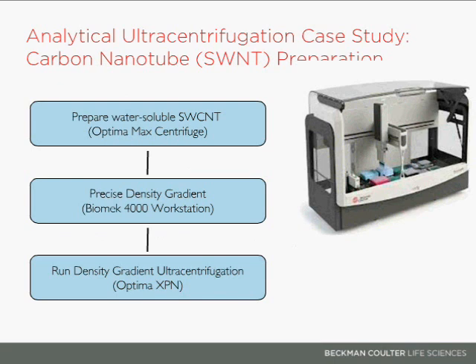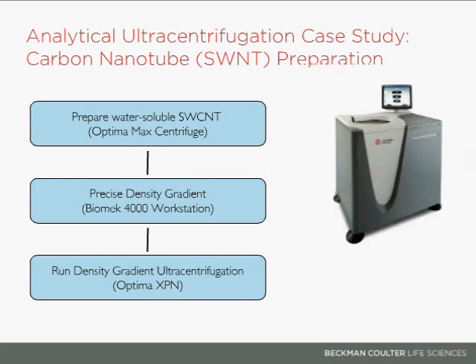I really need to pick up a new camera. My iPhone does not do this justice, but you do see on the right that the black solution of carbon nanotubes before the centrifuge and density gradient was able to turn into vividly colored individual chiralities of carbon nanotubes. We once again collected only the 6,5 carbon nanotube.